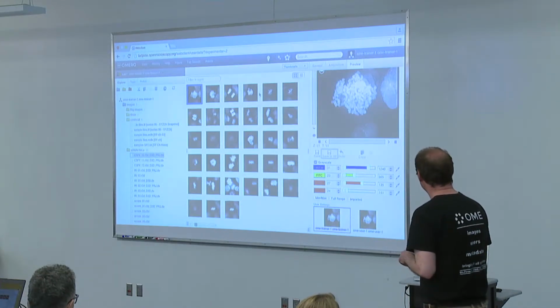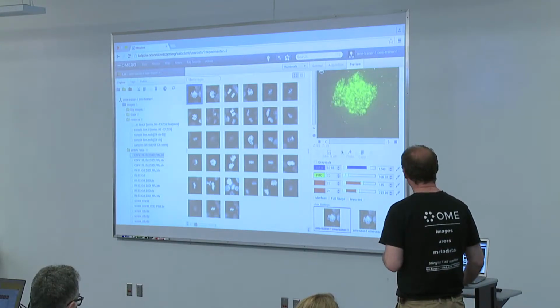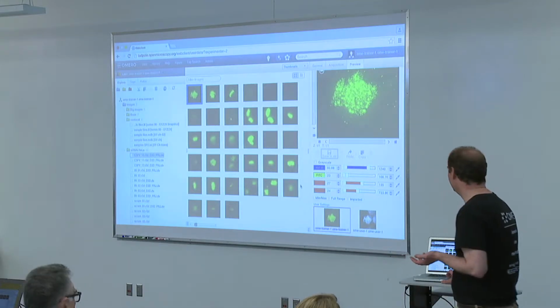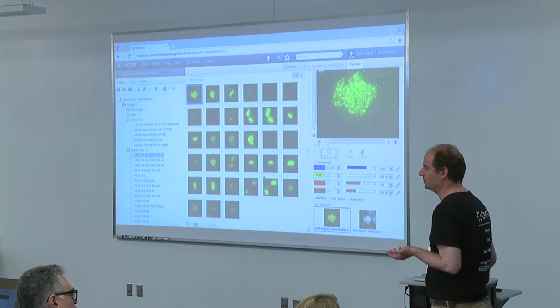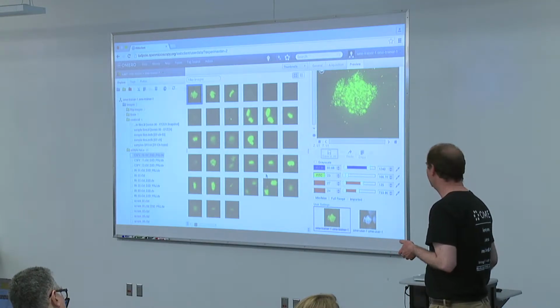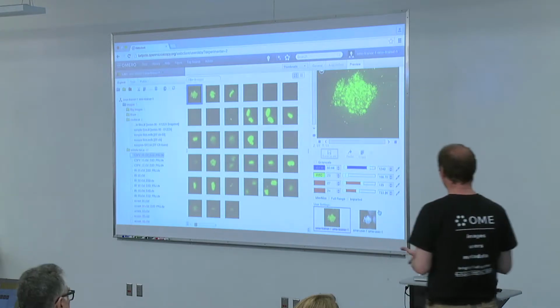Right, so if I don't like it, I can undo one image, and I go save to all again. And I'm back to what I was before. So I don't have to go one by one with these 30 images and wonder if I would like them green or not. Okay, so this is another cooperation. So this is the cooperation covered.